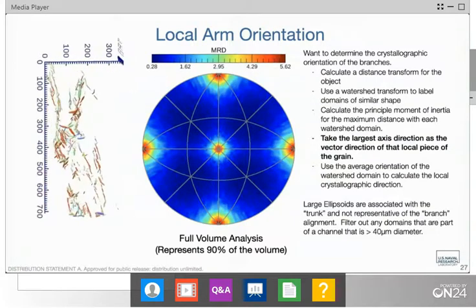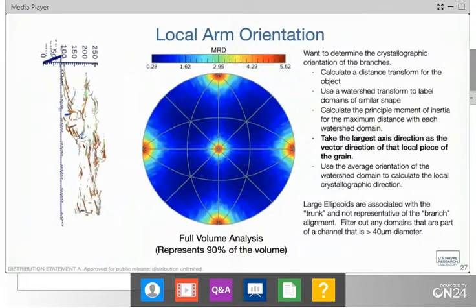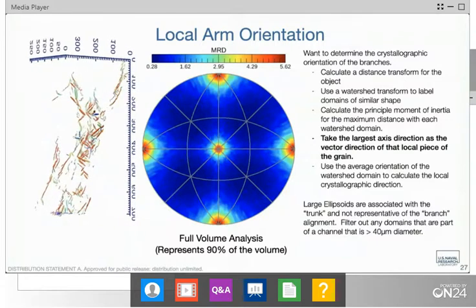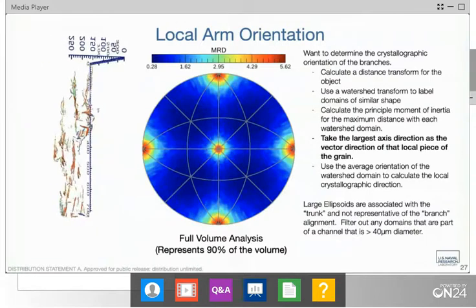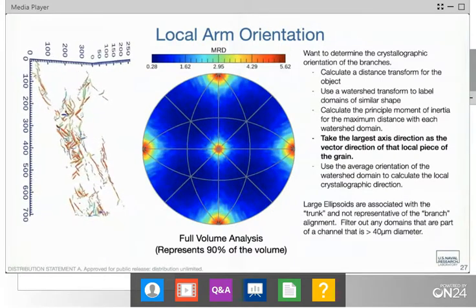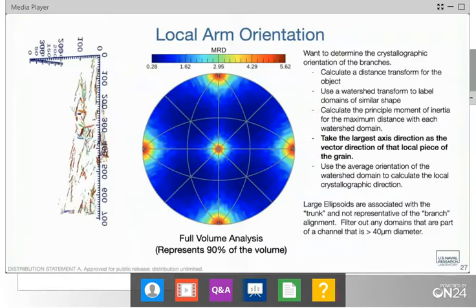What's interesting, and what this slide is showing, is that even though that's happening on the sub-micron scale, we're seeing it reflected in the more mesoscale microstructure as well. Those clusters of cells still add up to a fairly textured, morphologically textured sample. I think there's still a lot of work to be done in figuring out exactly that relationship, but your results and what I'm seeing are very consistent with each other.